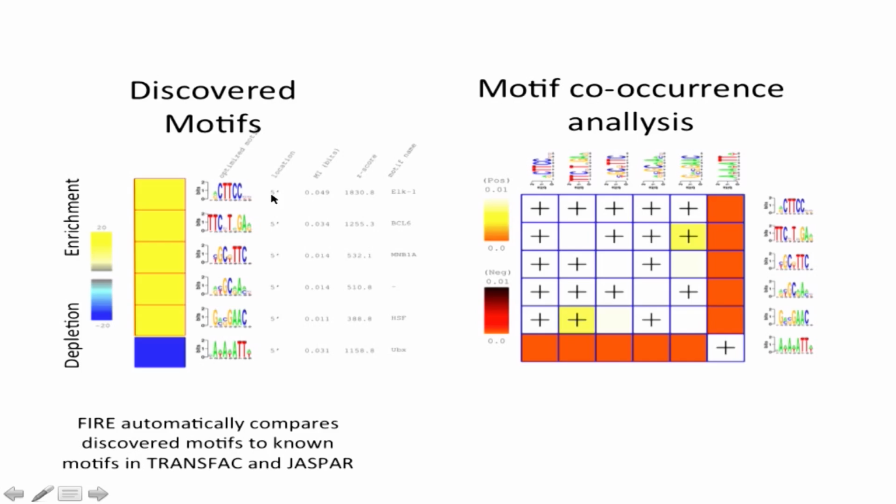It's an ETS family type of protein that is known to bind to this type of sequence here. But the point here is that all of these sequences came from the same set of peaks. I mean, they're not present in 100% of the peaks. They are essentially more abundant in the true peaks compared to the random peaks. And this sequence here is more abundant in the random peaks compared to the true peaks, okay?